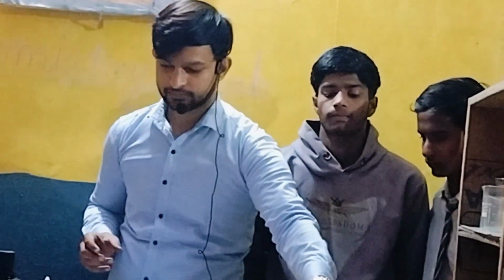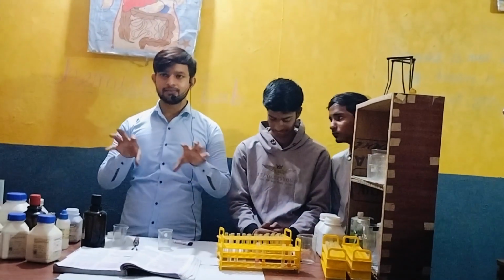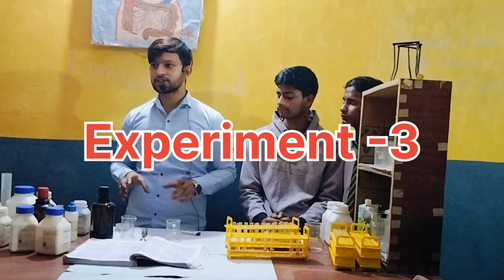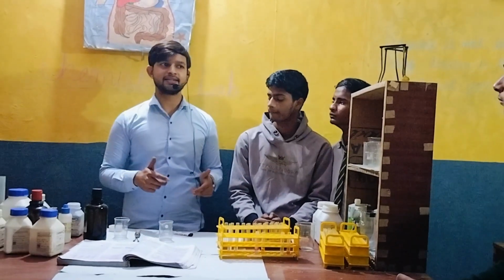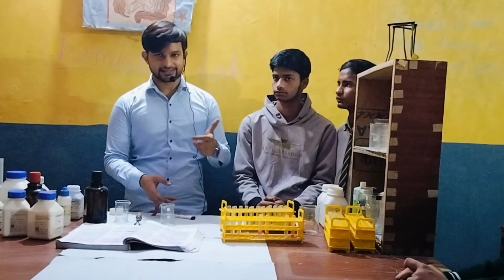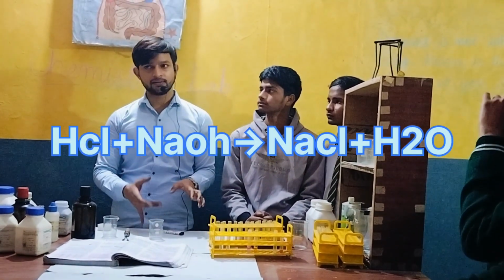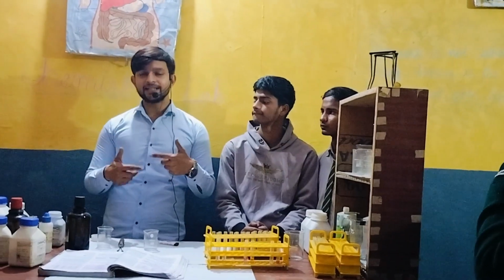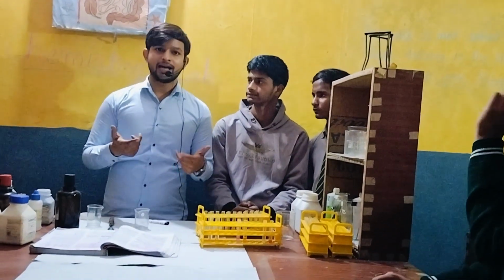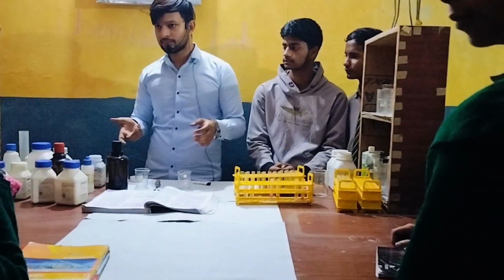Okay, please stop. Now the next reaction is acid and base reaction. This reaction is known as neutralization reaction. Okay, in which we will take acid HCl and base NaOH. So what will happen? The HCl will give H plus ions. Okay, HCl will give H plus and the NaOH base will give OH minus ions.